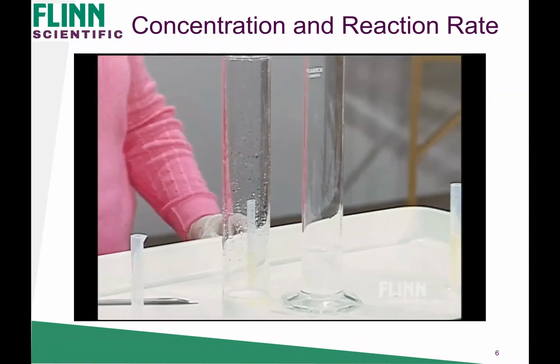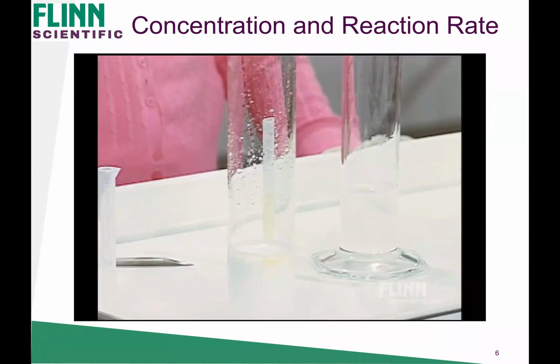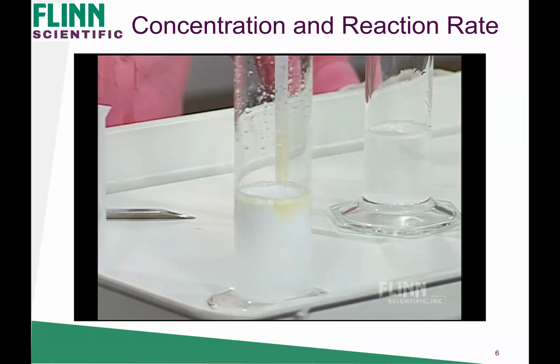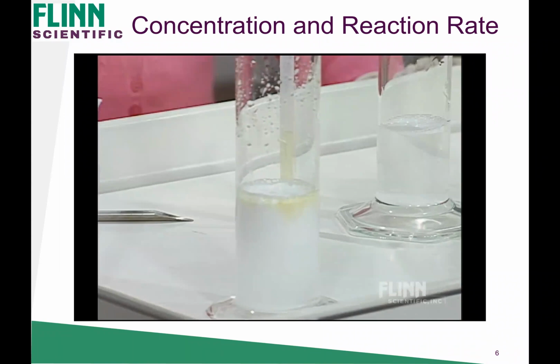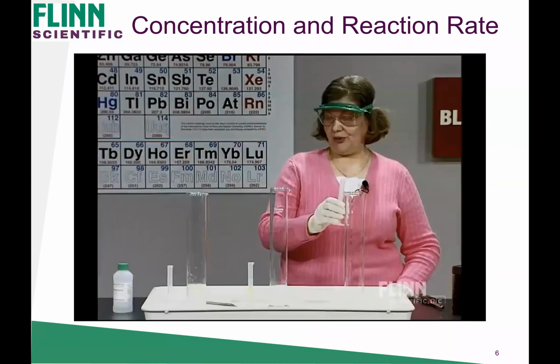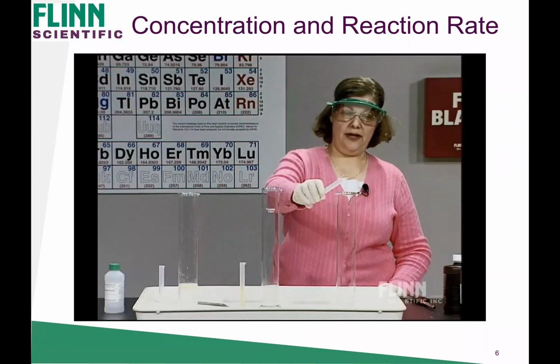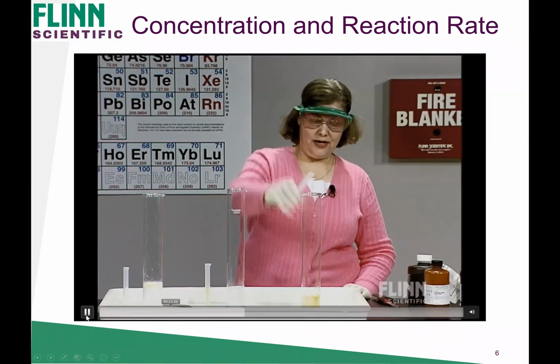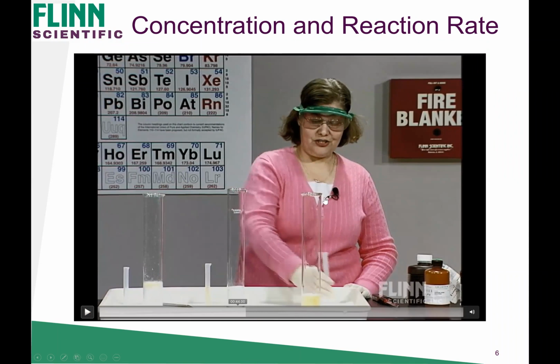In contrast, this seems to be happening fairly slowly, right? There's not this very vigorous reaction. You can see it decomposing there as we zoom in, but it's not instantaneously overflowing. And now we go to our other flask here, and we're going to pour our sodium iodide in here. Now, this is a different concentration of hydrogen peroxide in this flask. Let's see what the result is.